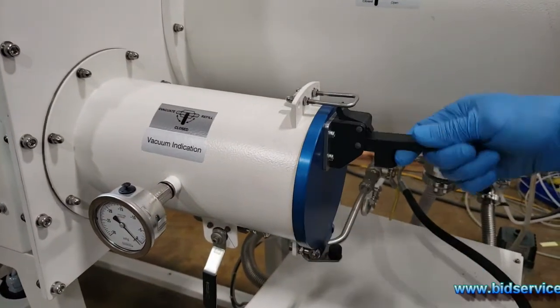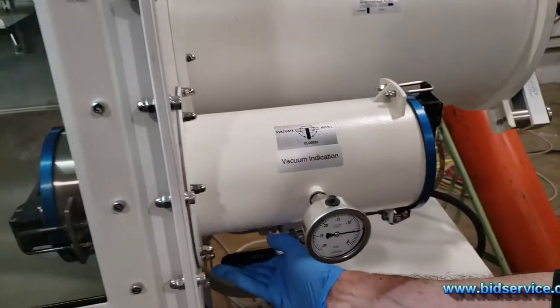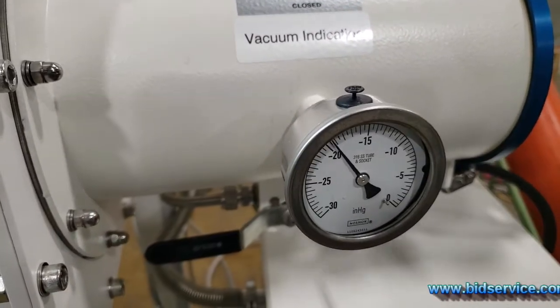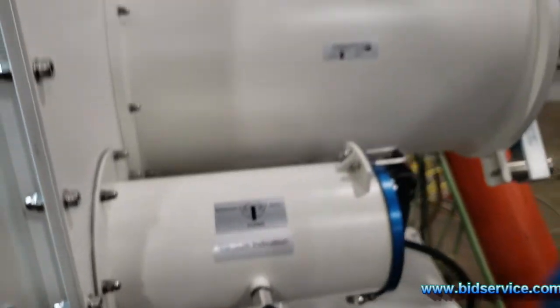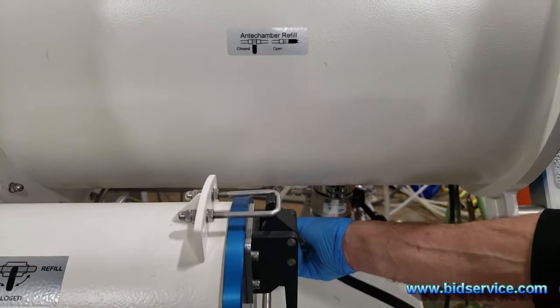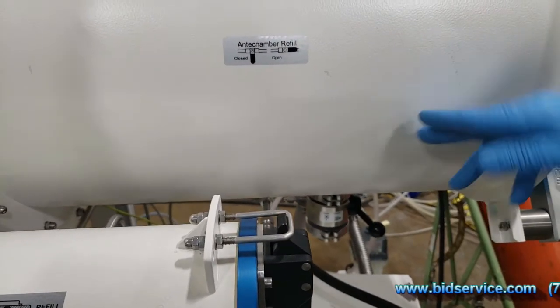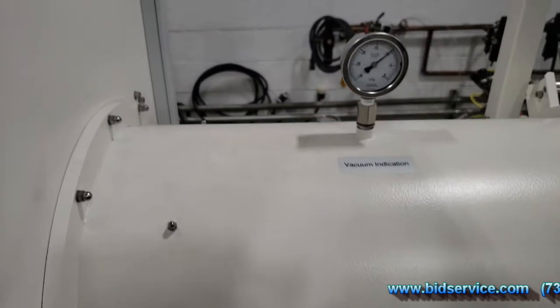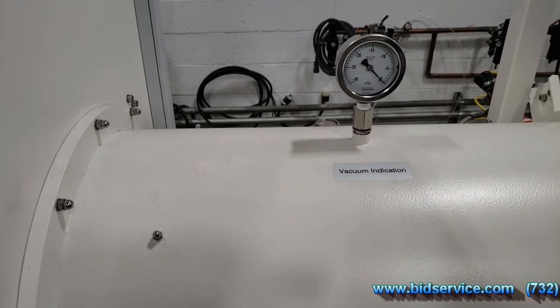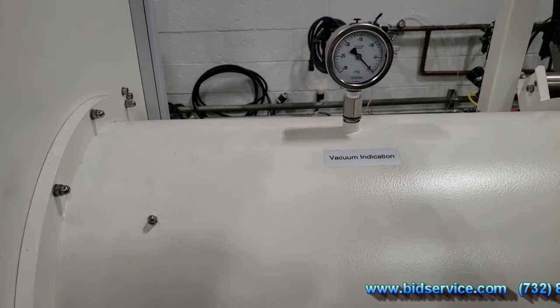They recommend you do three cycles, so we can evacuate. While that's evacuating, we'll go ahead and look at the top one here. Make sure the vacuum is closed. We'll bring in nitrogen from the bottle — that's what we recommend, without pressure. So we'll do nitrogen at low PSI.